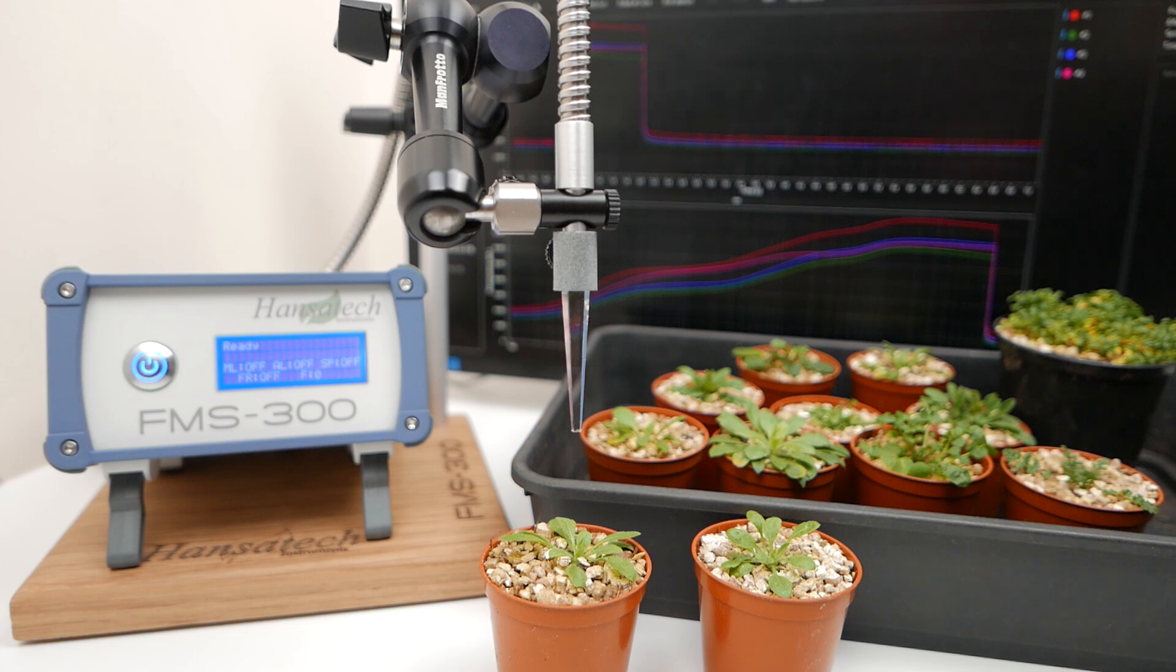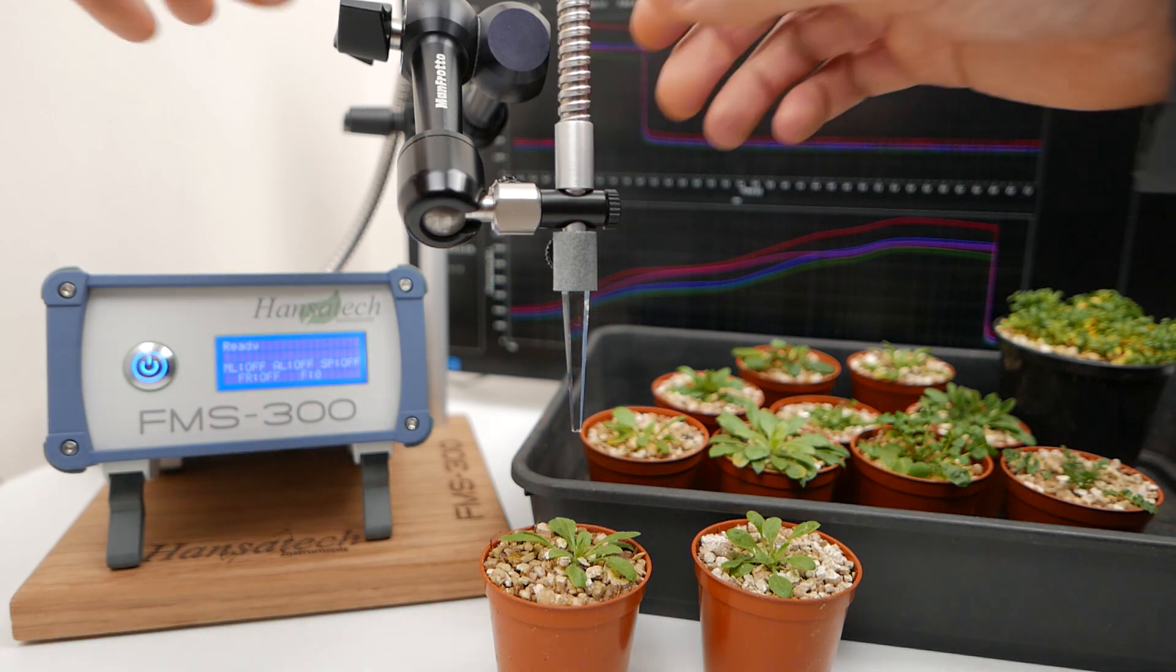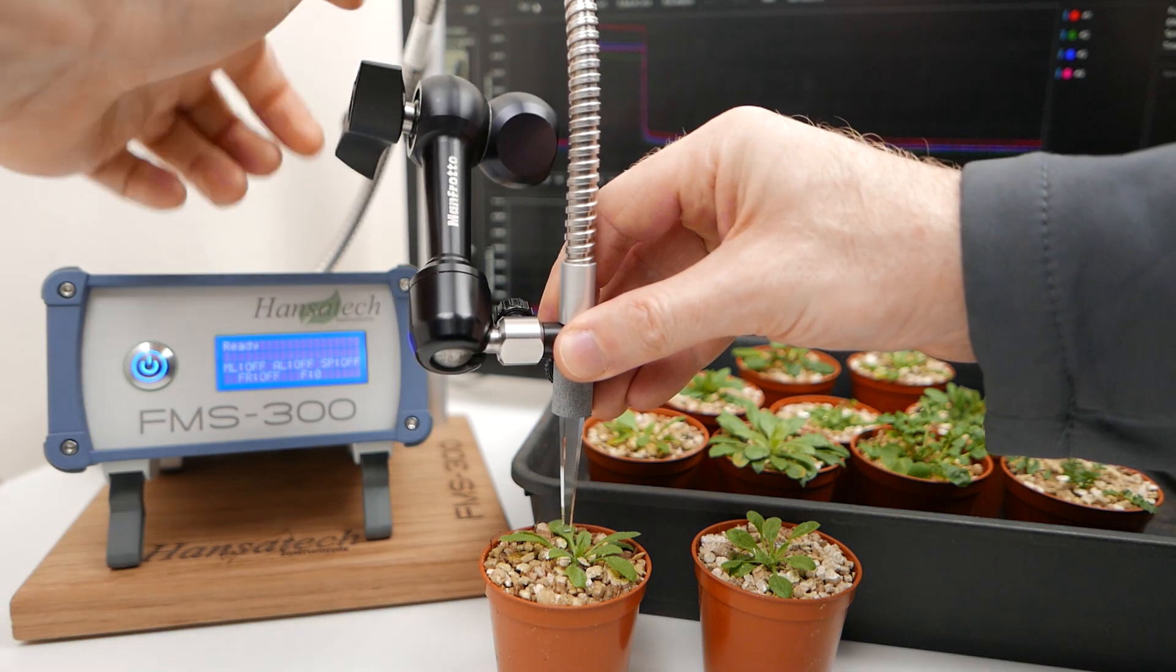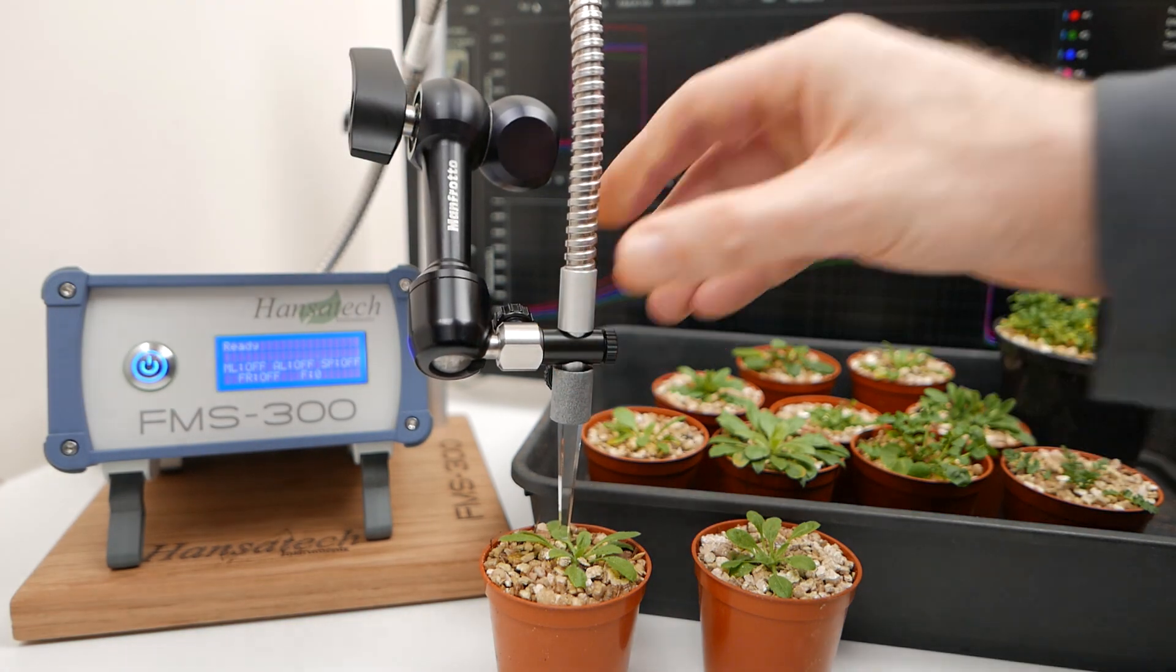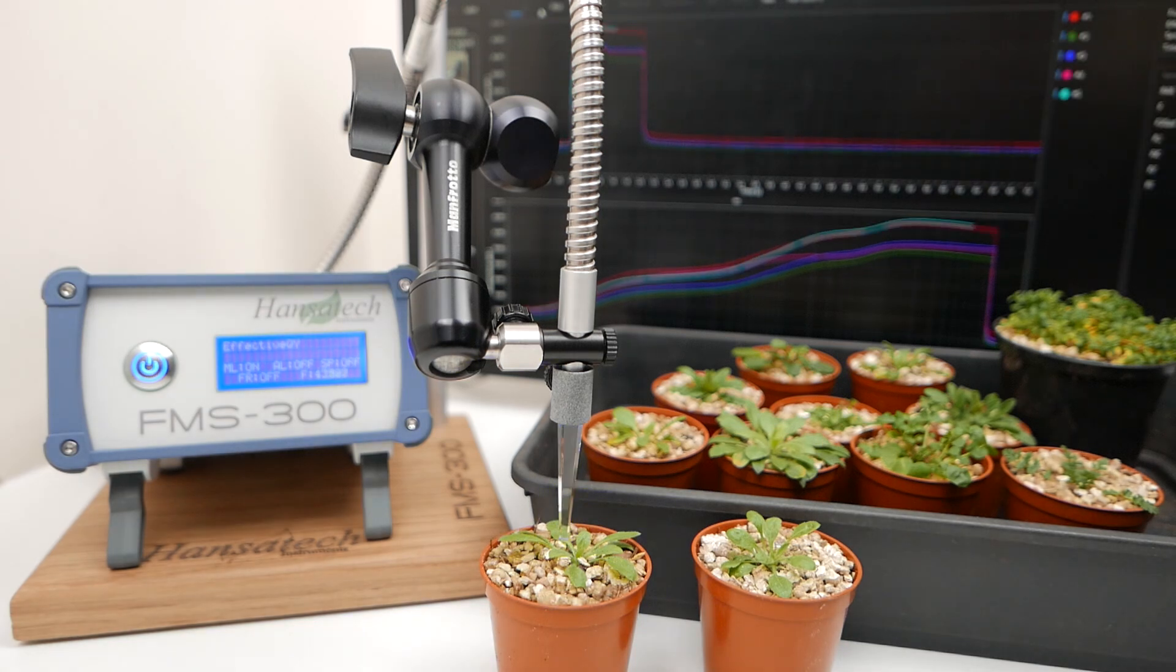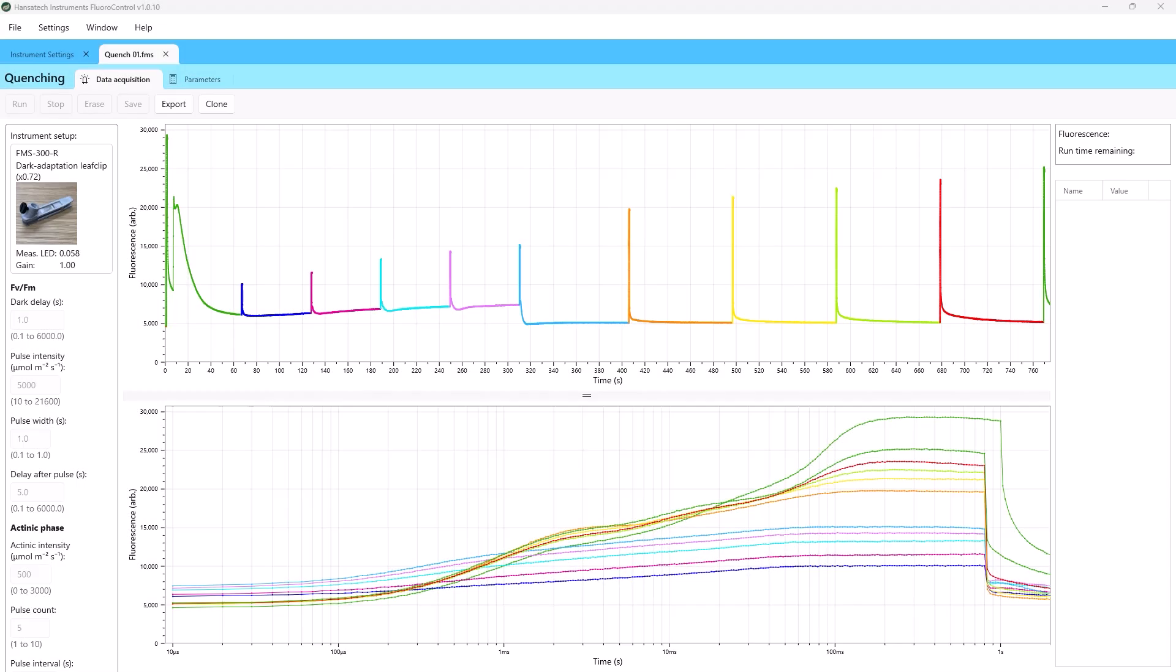With the FMS 300's clone feature, you can recreate an experimental routine with a single click, straight from a saved results file. Ideal for replication and sharing with colleagues and students.